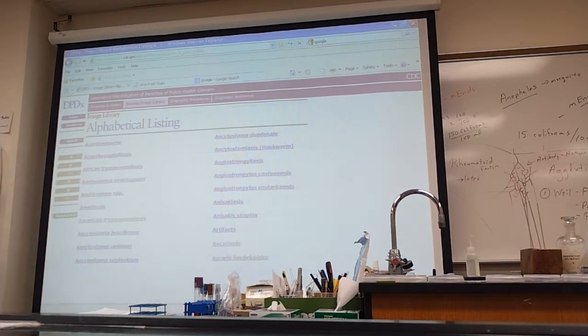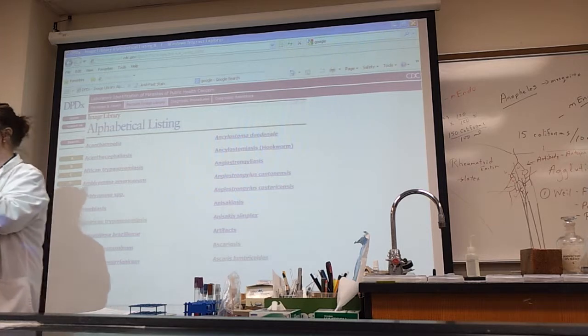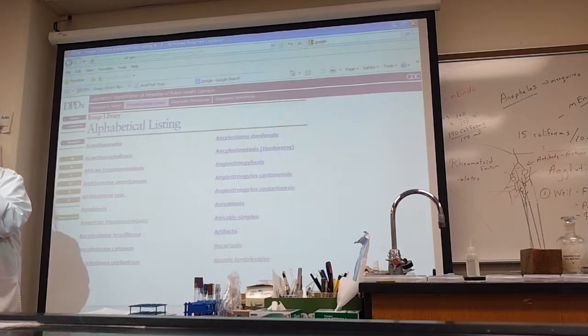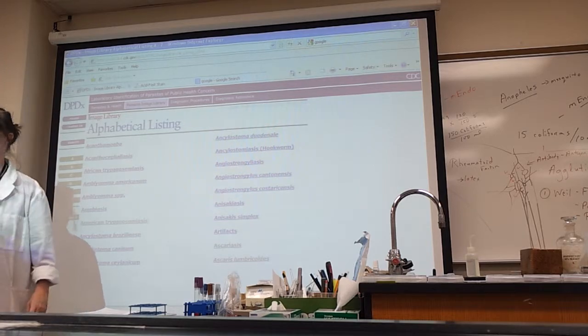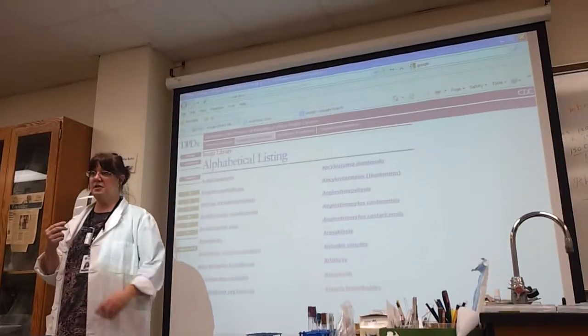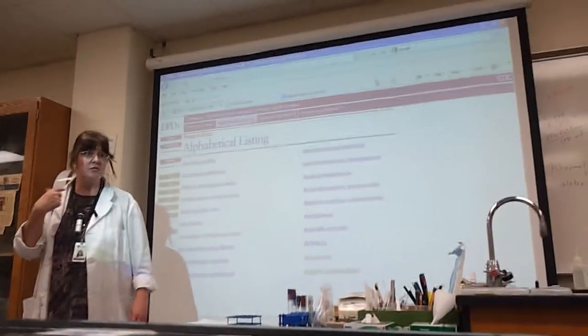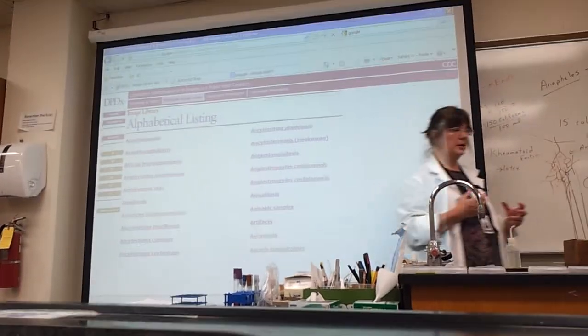First, when we're talking about parasitic protozoans, remember they have the cyst, that's the resting ball form, and a ball is a ball. But then they have the moving feeding form called the trophozoite. You often identify them by the moving form called the trophozoite. Also need to learn the relevant type of disease hints to them.